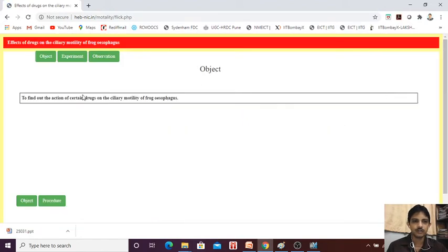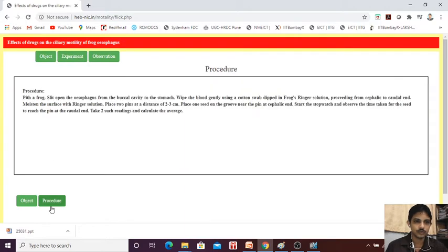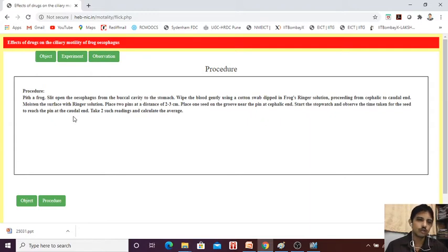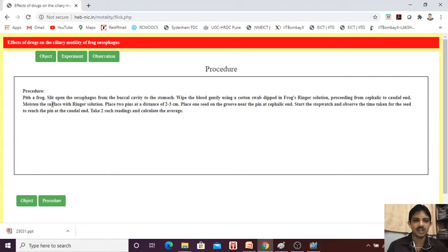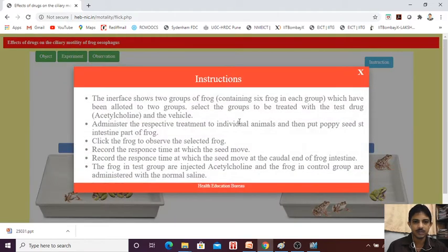Now, to find out the objective — to find out the effect of certain drugs. Now, what is the procedure? It is the normal procedure for how we have to perform the experiment, though we are not using the animal. But generally, after pitting or stunning the animal, we have to split open the esophagus and buccal cavity. We have to pin it. I will show you the experiment.